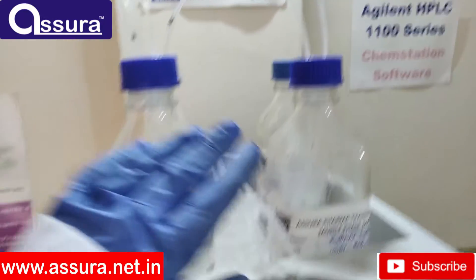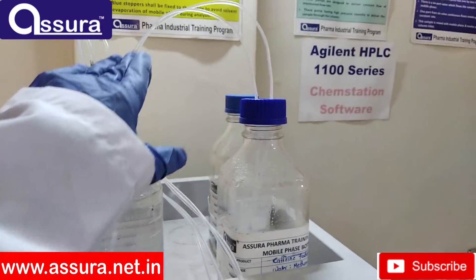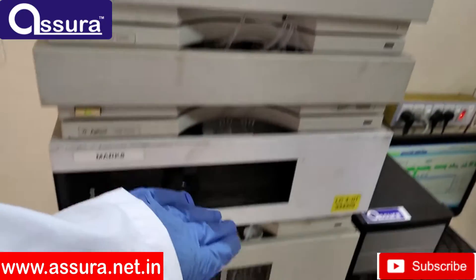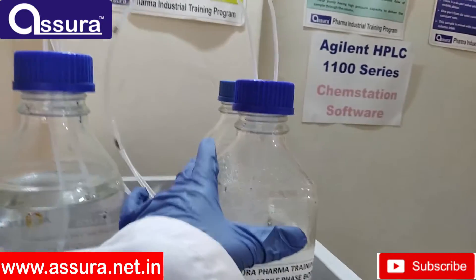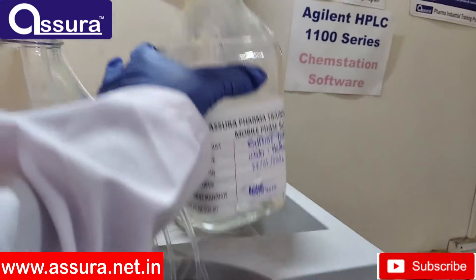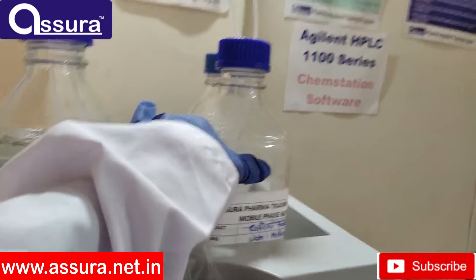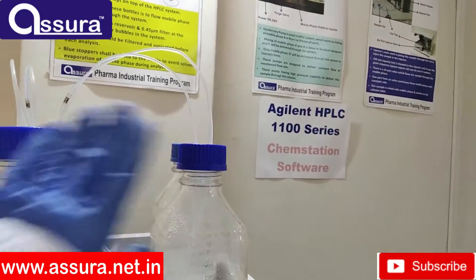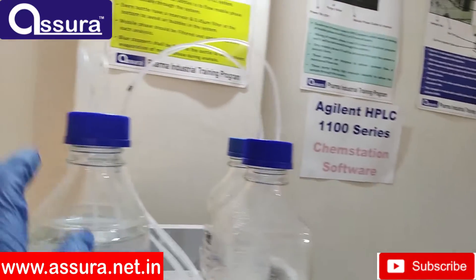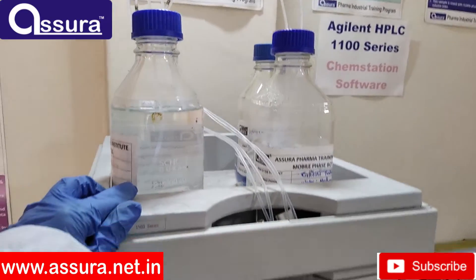These bottles are placed on top of the HPLC booth. The main purpose of this bottle is to flow mobile phase gravitationally through the system. Every bottle has a reservoir and a 0.45 micron filter at the bottom to avoid air bubbles in the system. Mobile phase should be filtered and sonicated before each analysis. A blue snap-cap stopper shall be fixed into the bottle to avoid solvent evaporation of mobile phase during analysis.